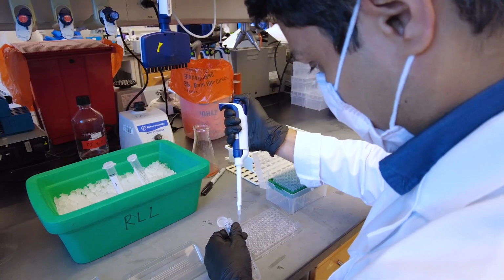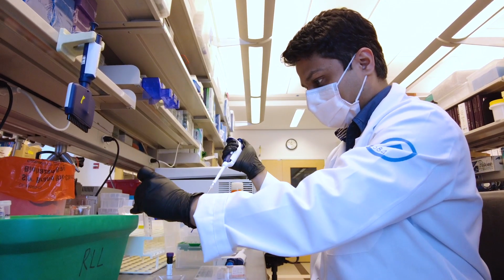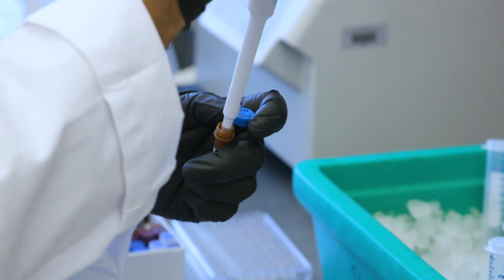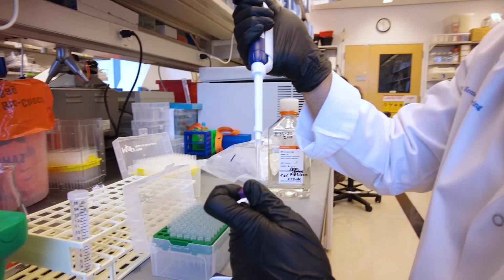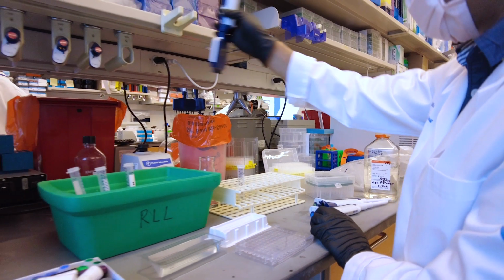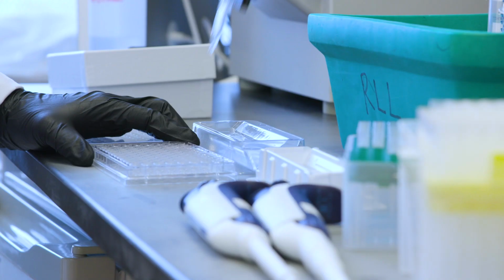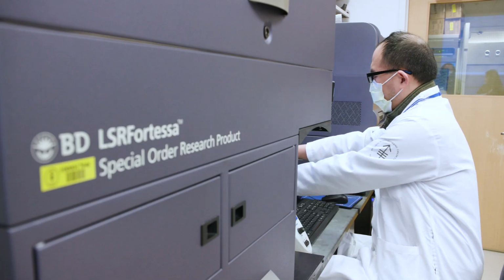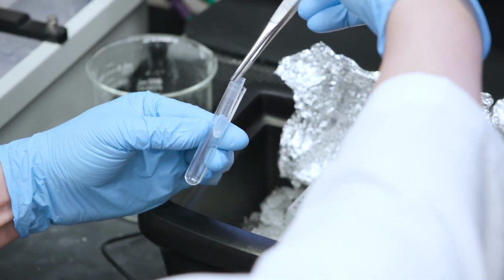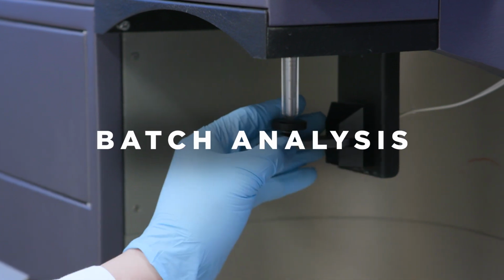This is where the samples are stained with a number of different antibodies conjugated to unique fluorescent molecules. Depending on the flow staining panel used, the results can measure the frequency of specific immune cell subsets in patients and evaluate whether the cells of interest are activated, proliferating, or expressing certain exhaustion or maturation markers. After the cells have been stained and washed with a relevant antibody panel, they're ready for acquisition and analysis on the flow cytometer.